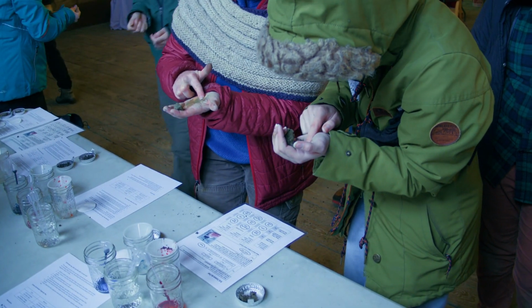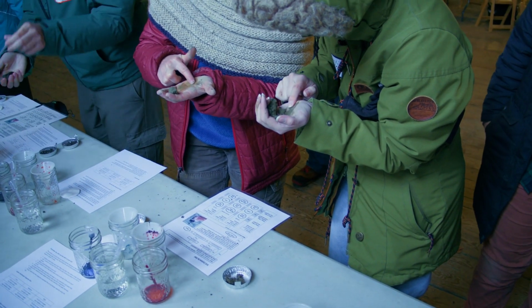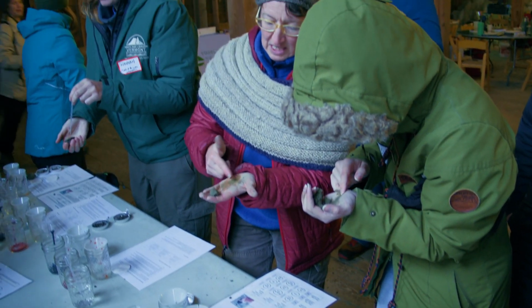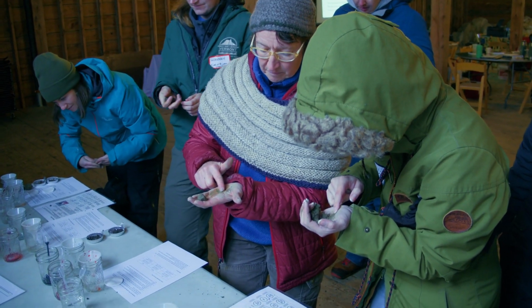Cool. There's grains in there, but there's a lot of suspended particles. Thank you guys. I think you are ready to figure out the CEC and the AEC of the soil.